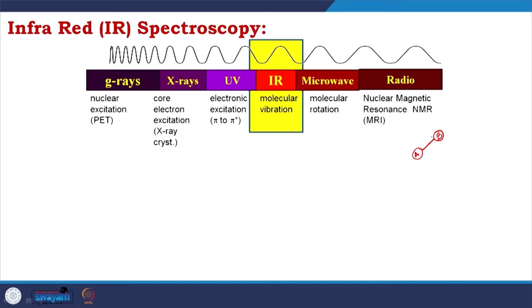As we have discussed, this bond could be explained in terms of connectivity as a spring. So, now it would show stretching.